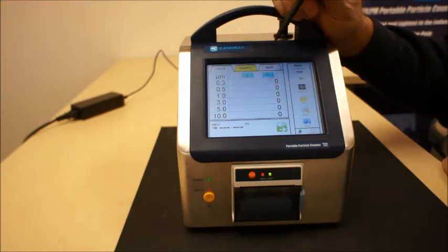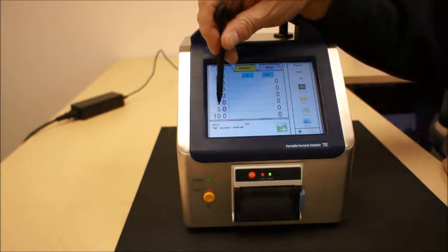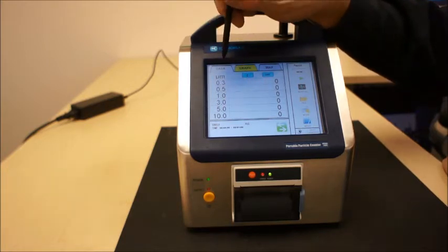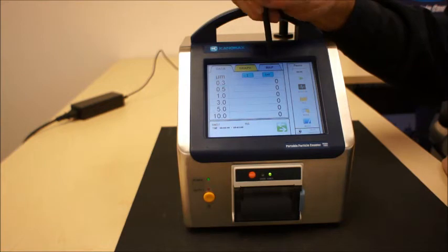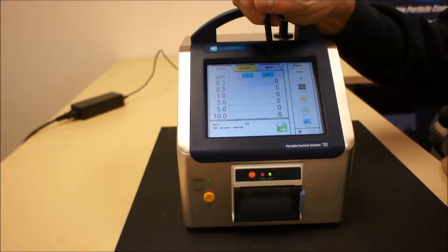The intuitive menu of the 3905-3910 series is extremely user-friendly. You can see from here the list of the six channel particle sizes that this unit will count. The units can be represented in a data format and a graphic format, and there's another tab that is representative of a map. You can load a JPEG of a map in here and in the isokinetic measurement mode you can actually have individual points identified for measurement, locating the particular points required in your ISO standard.